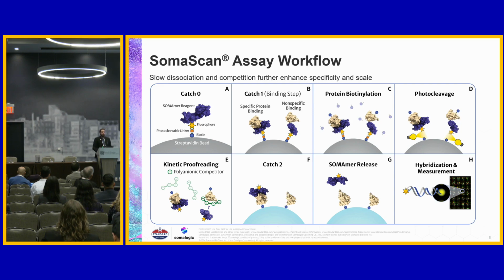And broken down to its most simple form, what we did was we turned a very difficult problem of measuring proteins, and we converted that into measuring DNA, which is something that we know how to do.